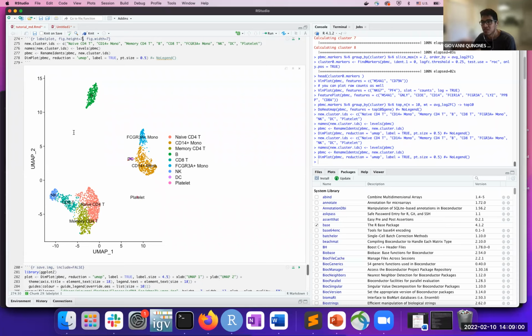So once you evaluate all the clusters that were present and that they match certain expectations, you'll sometimes be left with a few other clusters that don't really match the cell types you were familiar with. And that will lead to the discovery of a new type of cell, which will later, of course, need to be validated through other experiments.